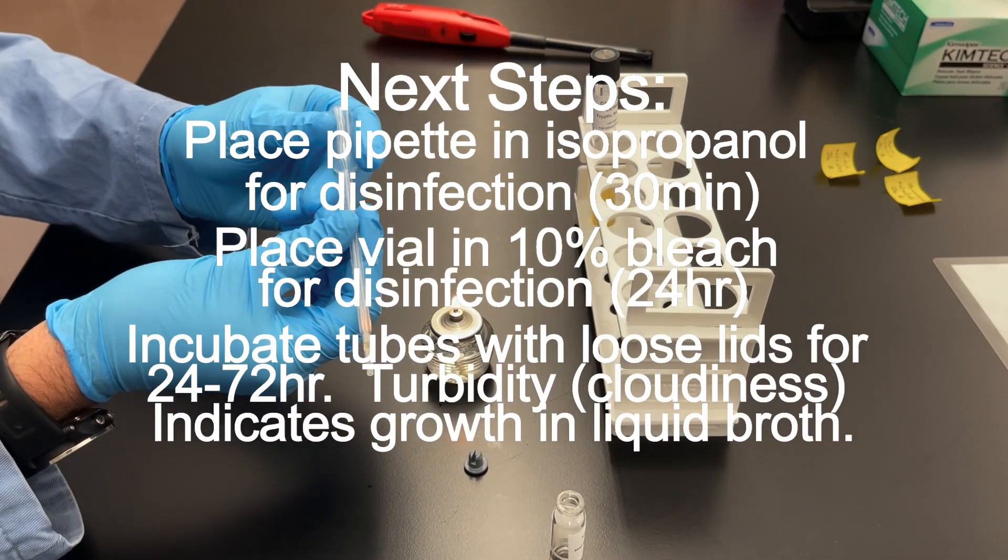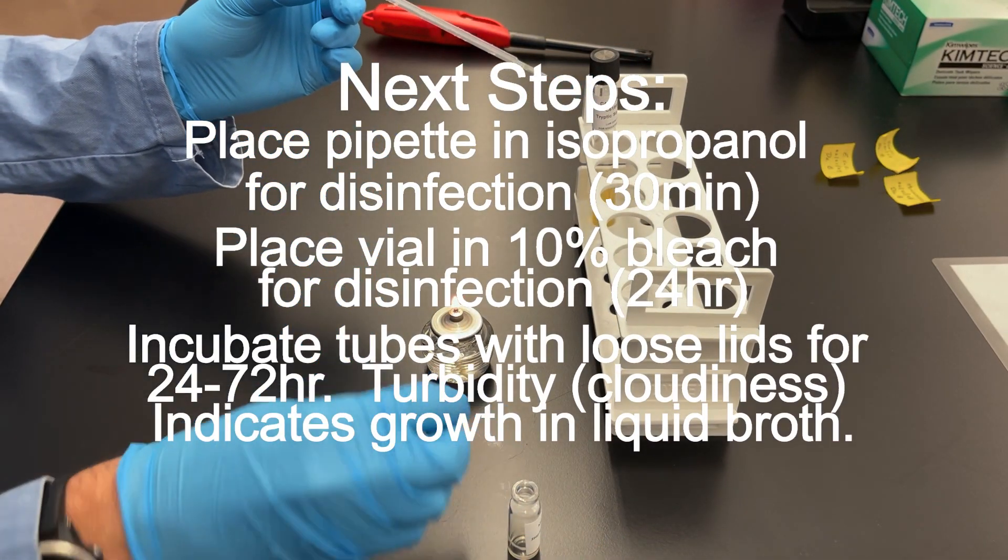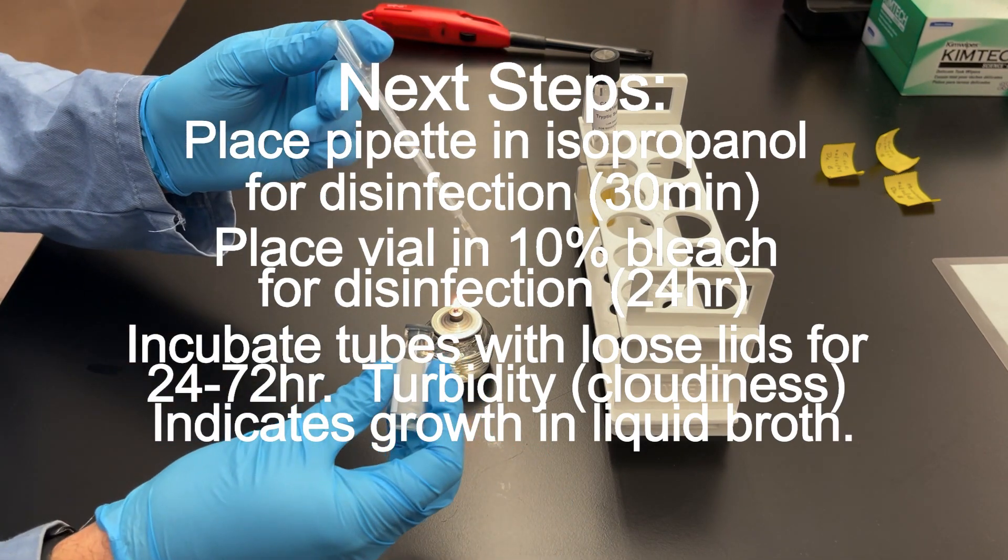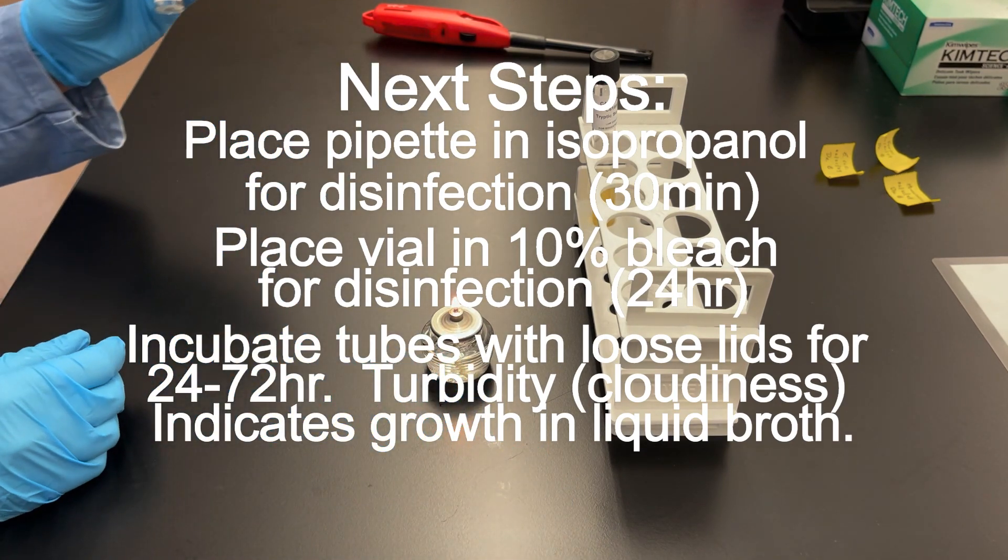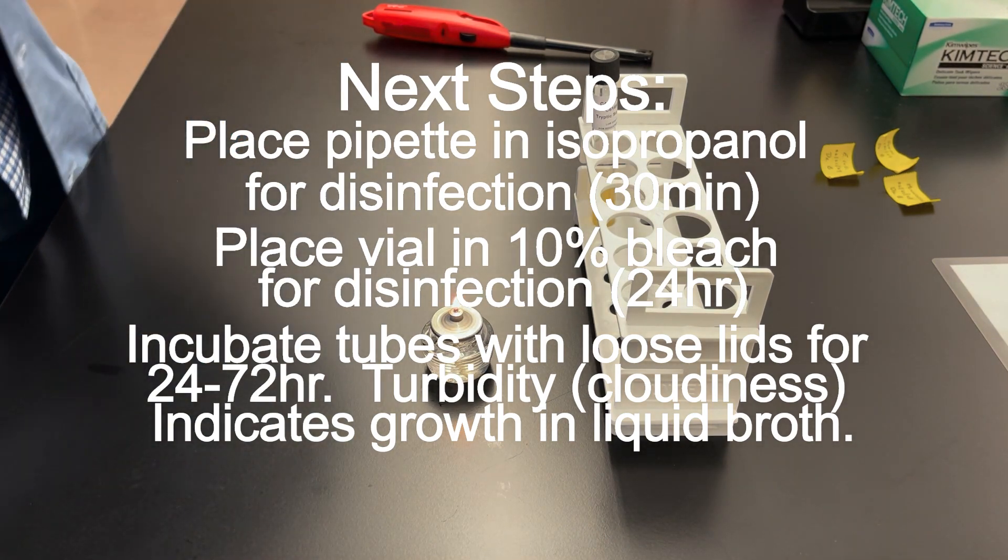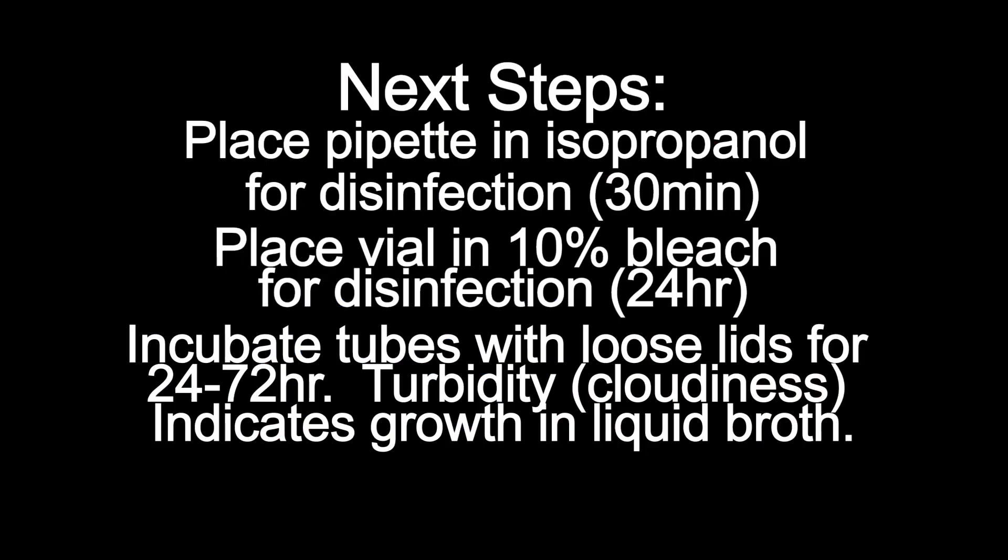Make sure you disinfect the pipette by putting it in the isopropanol for 30 minutes before disposal. The vial that's now empty needs to be disinfected and that goes in 10% bleach for 24 hours. And the tube that you just set up that now has the bacteria growing, it needs to grow for somewhere between 24 and 72 hours with the lids loosened.